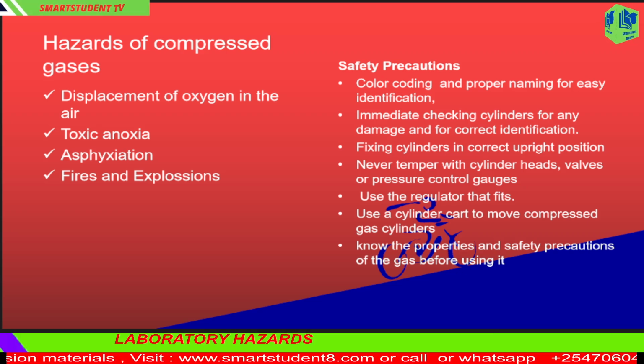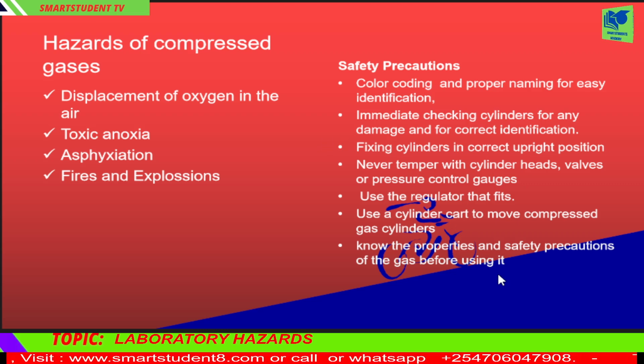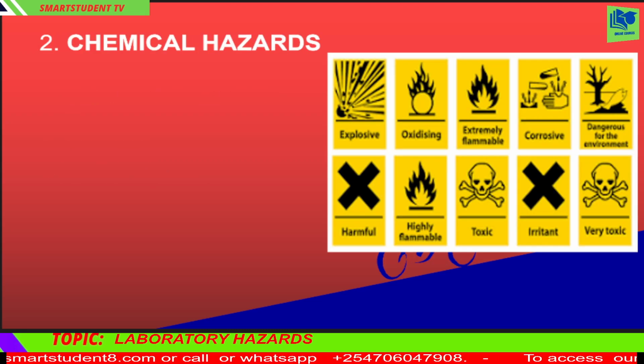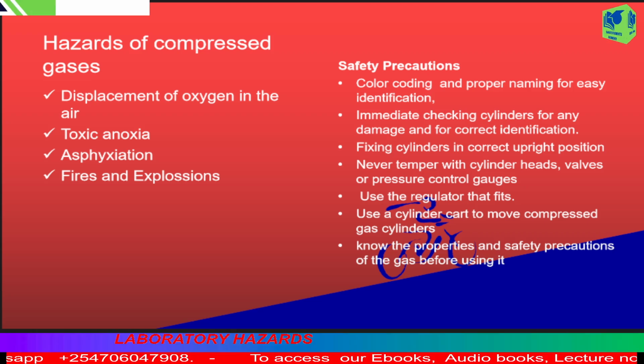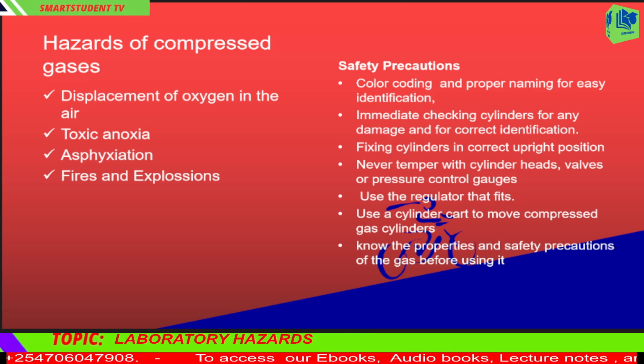Keep all compressed gas cylinders capped until ready to use, and then place the correct regulator on the valve. Recap when work is finished. 9. Always keep the cap on the cylinder while moving it and keep it in place until the cylinder is secured. Always cap empty cylinders. 10. Never use oil, grease, or other combustible substances with oxygen cylinders, valves, or regulators.